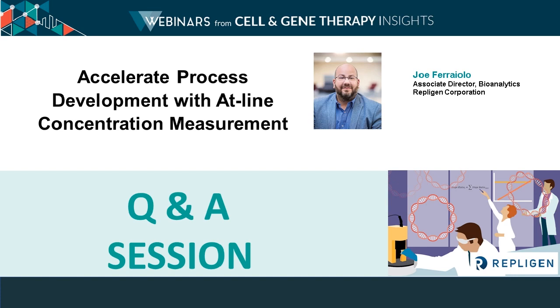Absolutely. And how does the UV distinguish AAV from host cell DNA from the harvest? Right. So it's a multi-wavelength slope analysis. We're looking at the relationship between the two wavelengths of interest and then doing a complex equation based off implementing slope-based extinction coefficients or published extinction coefficients from literature to be able to calculate the concentration.